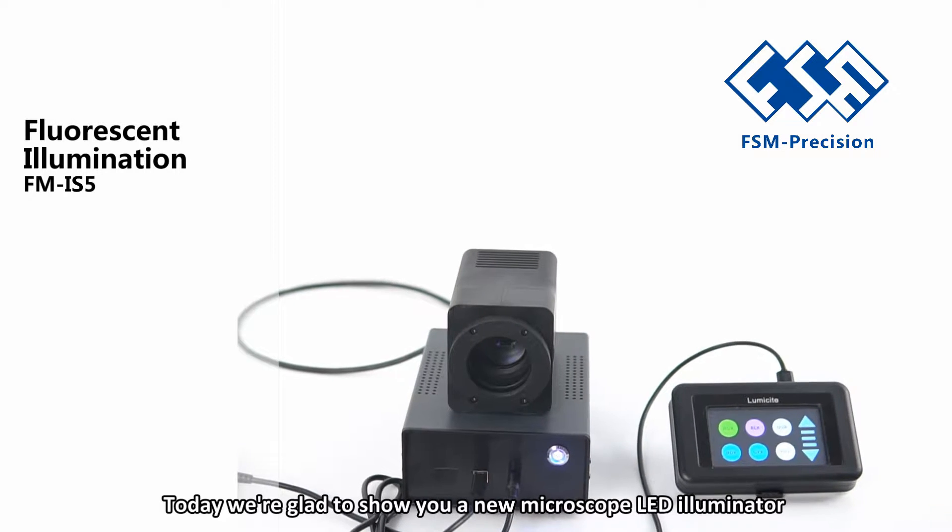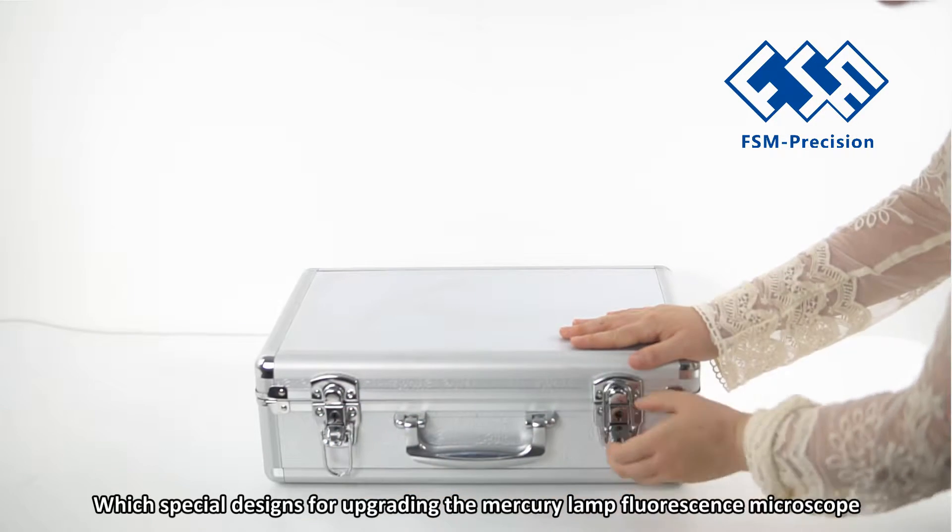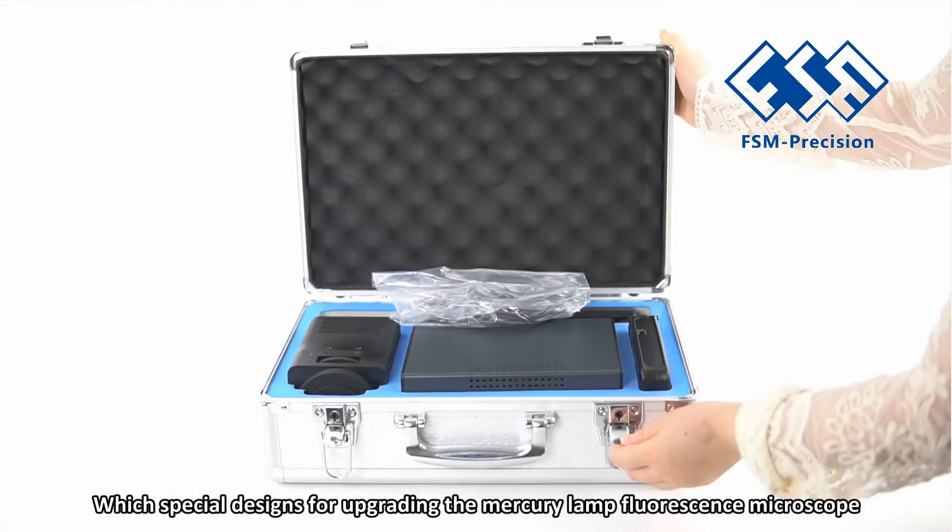Hello everyone, today we are glad to show you a new microscope LED illuminator which is specially designed for upgrading the mercury lamp fluorescence microscope.